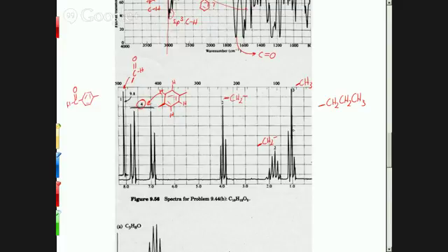But when we say that, we also want to check that it makes sense with the other peaks. So that means that this CH2 should be split into how many peaks? How many neighbors do these hydrogens have? Just these two. These two have 5. These two have 2 neighbors. So that means it should be split into a triplet, 3 peaks. And then these also have 2 neighbors, so they should also be a triplet. And that's exactly what we see, right? That one's a triplet and that one's a triplet. So that tells us that we can be reasonably certain that this is another piece.